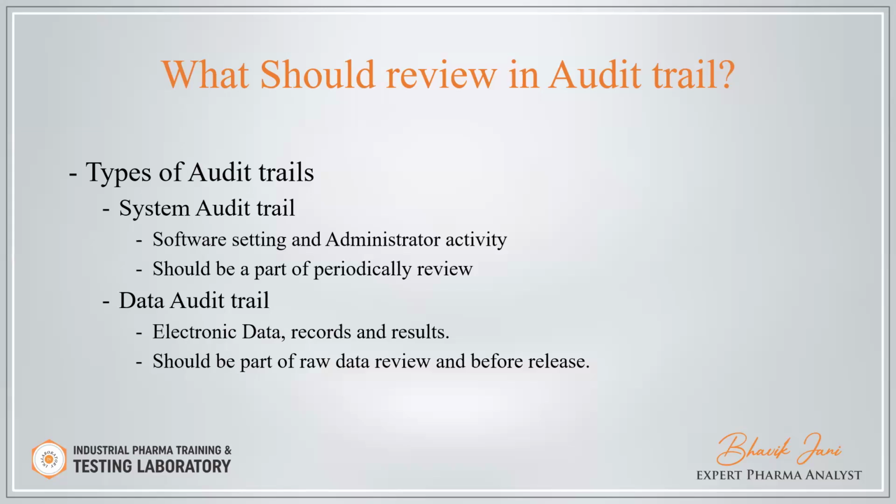And data audit trail means electronic data records or results. Whenever results are generated, they come under the data audit trail. It should be a part of the raw data review and the review before batch release. The data audit trail should be reviewed before release of the batch.